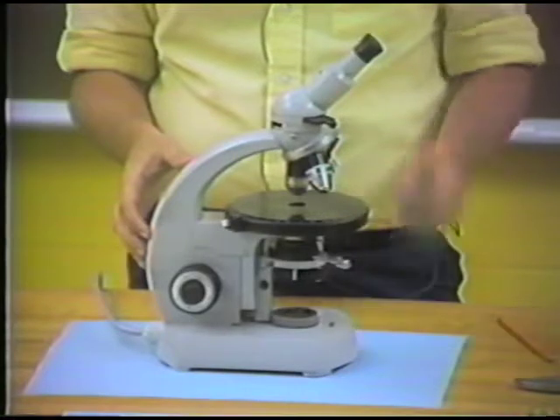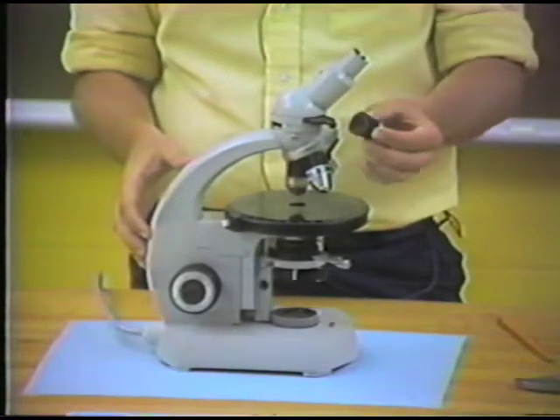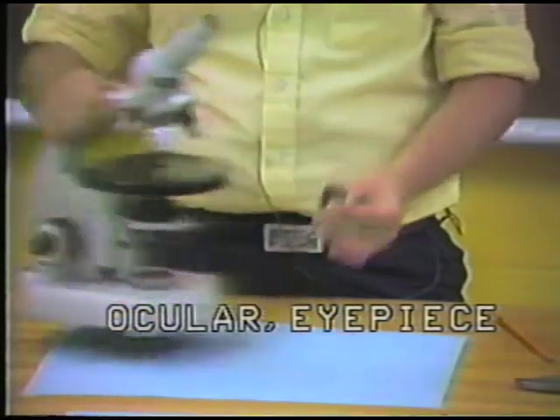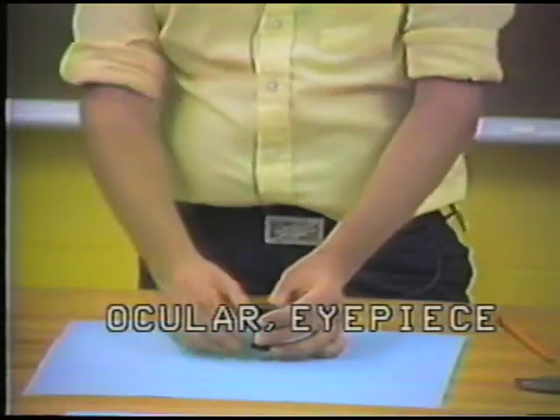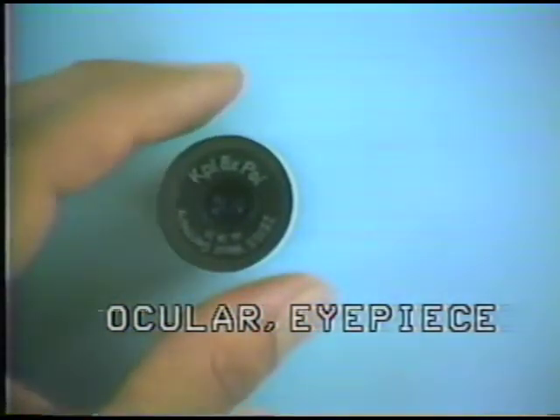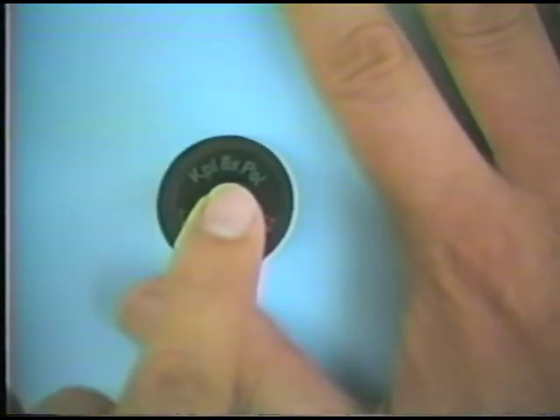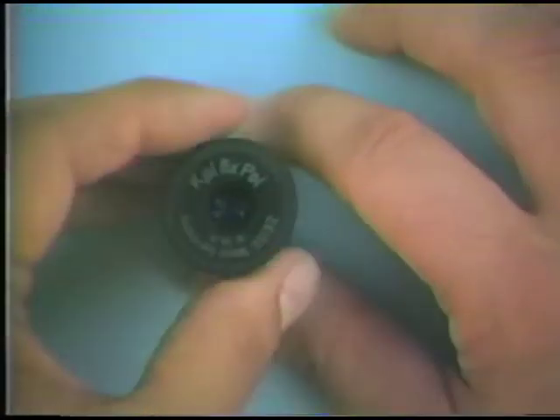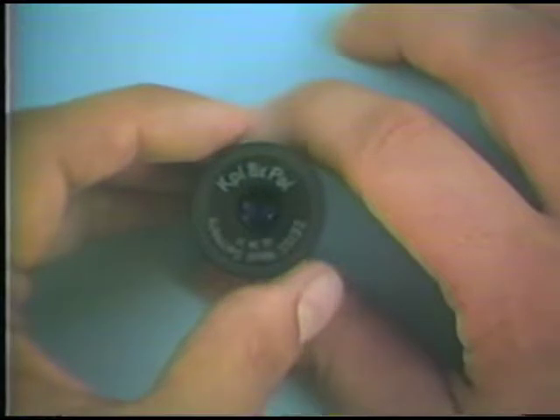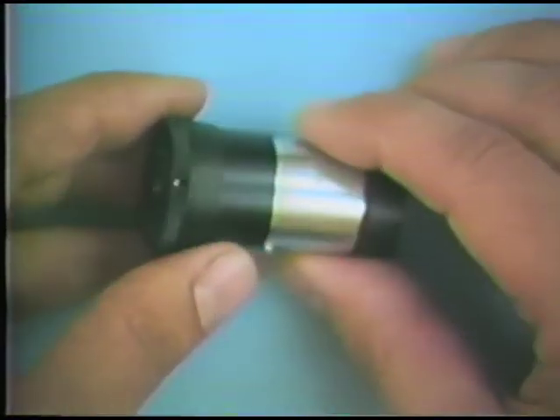I'll start at the top with this removable bit of optics here, which is called the ocular, or the eyepiece of the microscope. If we look at the eyepiece or ocular here, you can see demonstrated on the top of the microscope is the symbol 8x. That indicates the degree of magnification that this ocular shows. Oculars have variation between, say, maybe 5 and 15x magnification.